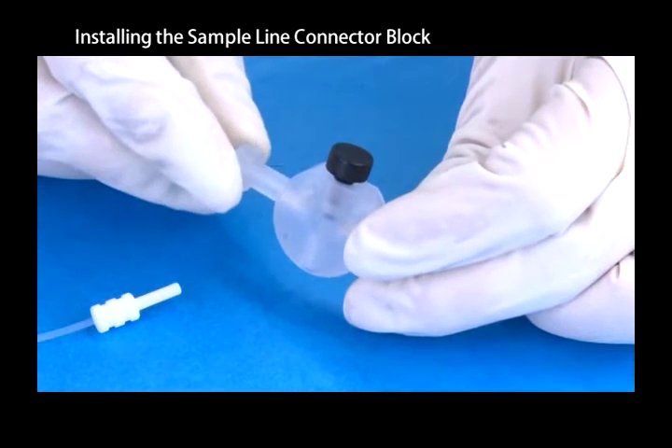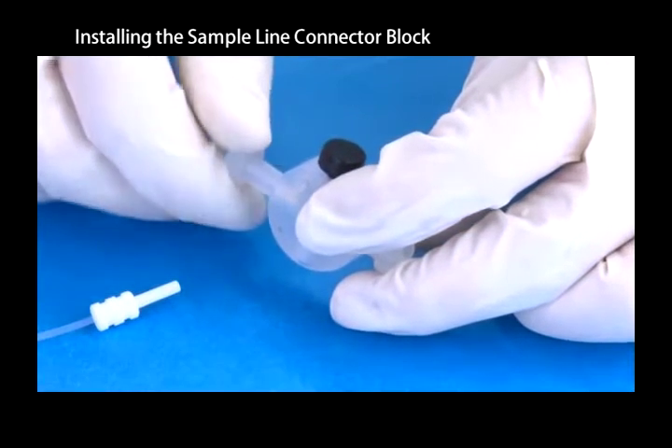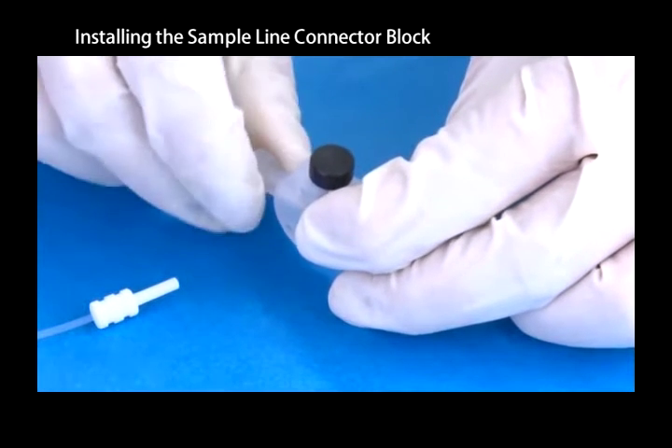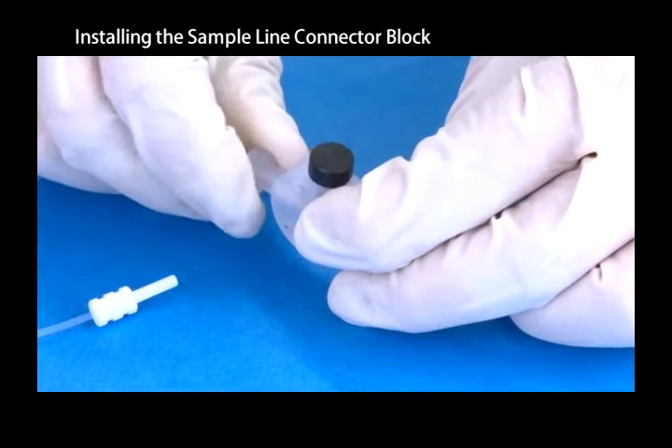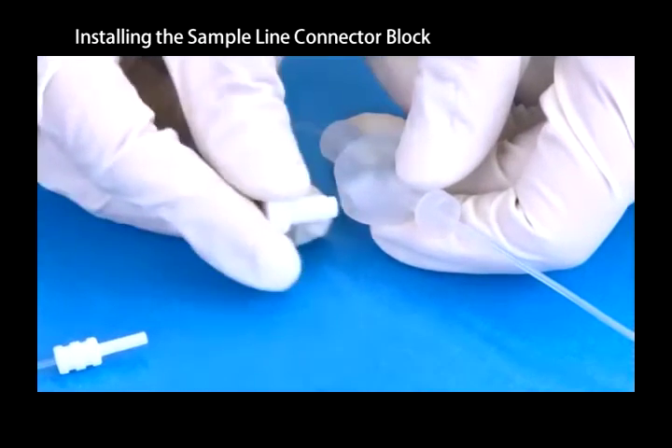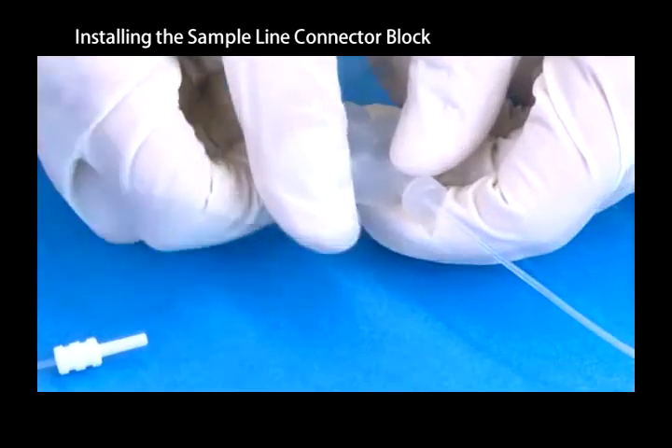Follow the same procedure to connect the tube from the nebulizer. Screw the supplied white plug into the connector block.